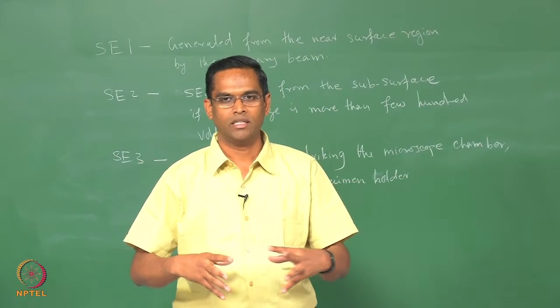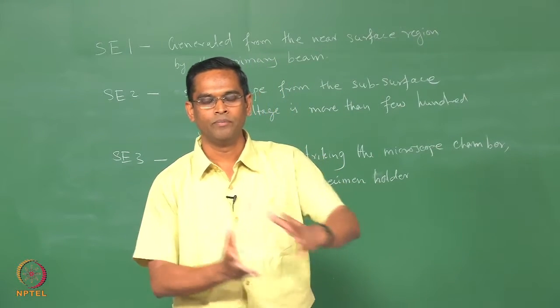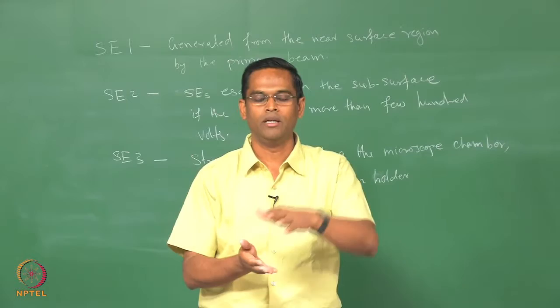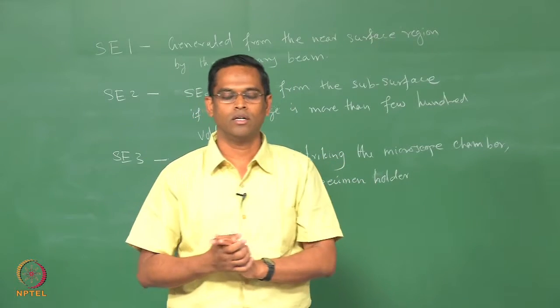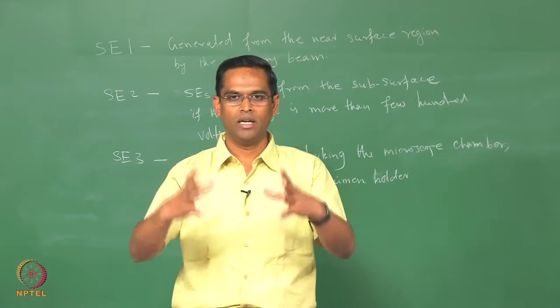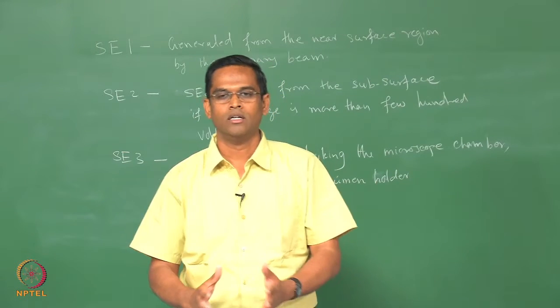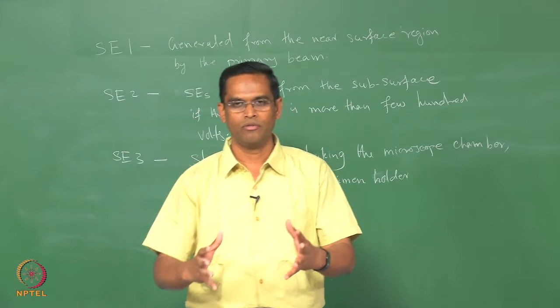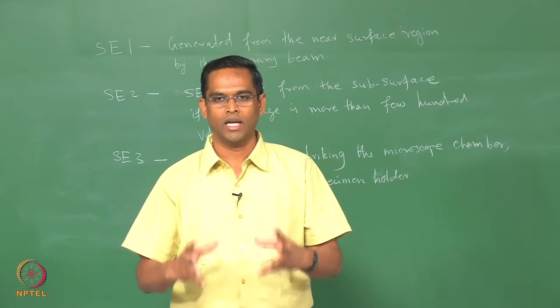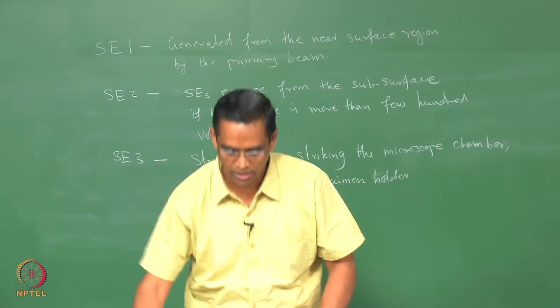So, the electron trajectories have deviated a little, the specimen has to be tilted effectively enough so that all the electron trajectories move towards the ET detector. But if you have an in-lens detector, you do not have that problem, it will effectively collect as much of the secondary electron emission from the immediate surface as possible. So, the collection is very effective, then the contrast is much better. That is what you are seeing here.